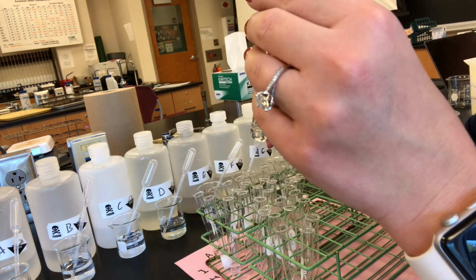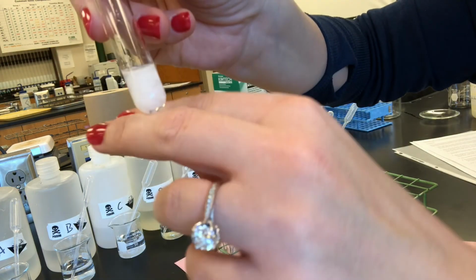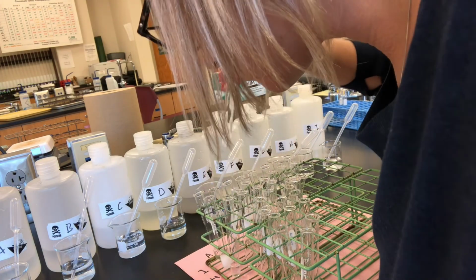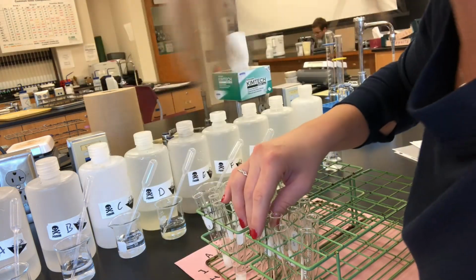A and F. Yep, we got action. White fluffy precipitate formed. That was A and F. A and F formed a precipitate.